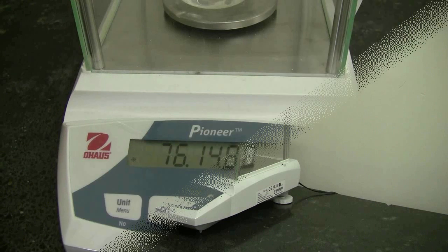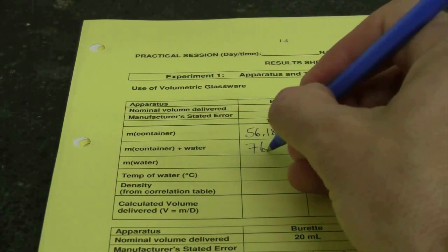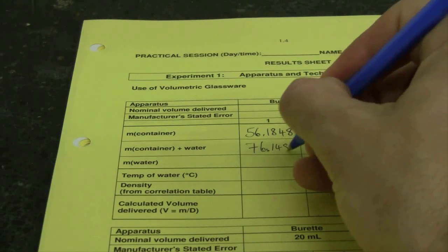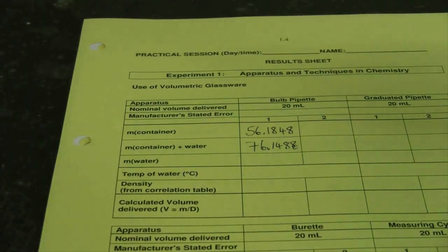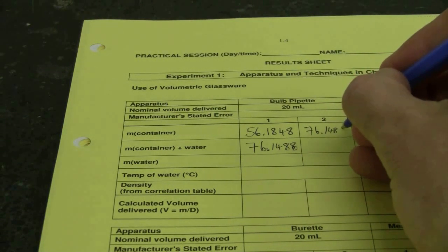Record that mass on your result sheet all four decimal places and note that to save you time in this experiment your final mass from the previous experiment can be your initial mass for your next trial so you can add your next 20 mls right on top of the previous 20 mls.